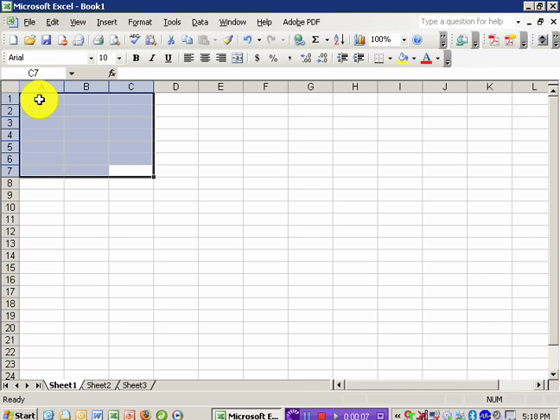In this video, we'll go over the Excel workup for Experiment 2 in Chem 1A. In this lab, we took the percent salt solutions and we measured their density, and we want to build a calibration plot that we can use to determine the unknown salt percent in our sample. So I'm going to go ahead and enter the X and the Y data.